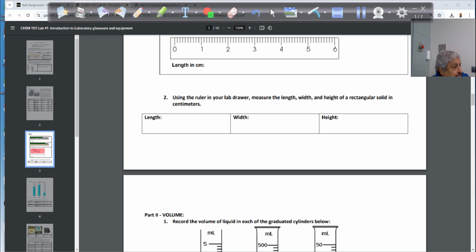So, the volume has to have three axes. Three dimensions. Area has only two dimensions, y and x. There is no z. When I measure the area, correct, in this case I will measure z and x, the area of this face. Not the volume of the whole object, but the face, for example.